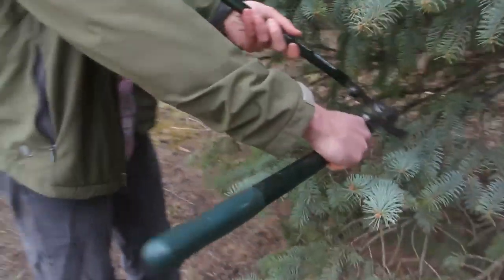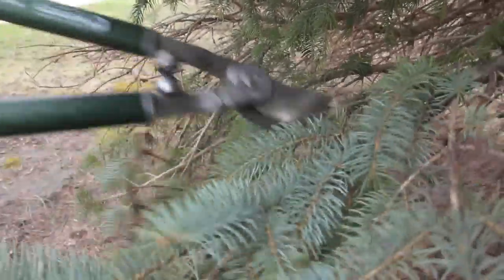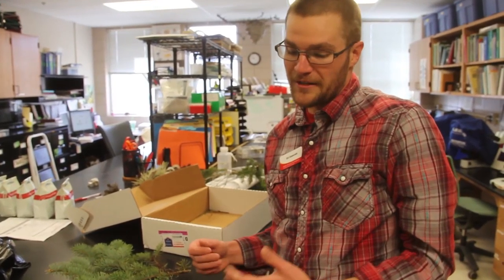We're going to go ahead and take a sample here. Get your pruning tools out and clip off a sample. As far as size goes, this is pretty good. I typically recommend something about the length of your forearm, because that's something that can be easily packaged and sent to us at the clinic.